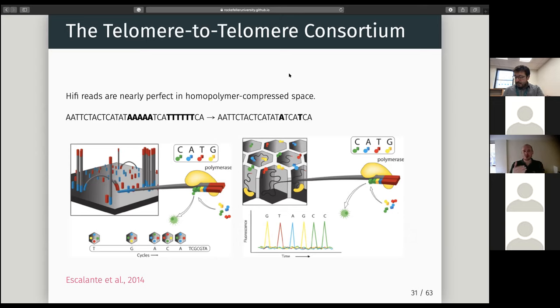In Illumina, you have stacks, so you have these levels, and you sequence one layer at a time. You sequence a lot of molecules in parallel, but at every step you sequence one nucleotide. So it's harder to get an issue because you're only adding one nucleotide at a time. By contrast, in PacBio and Nanopore, the sequencing is continuous. So you keep sequencing, and you're getting this signal over time. Therefore, being able to precisely identify where one nucleotide stops and the next nucleotide starts is much, much more challenging.